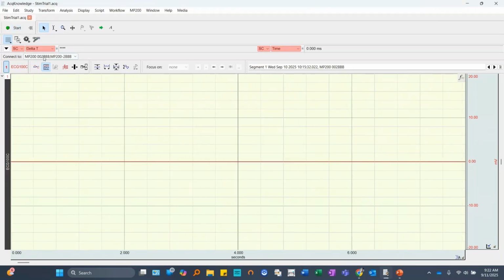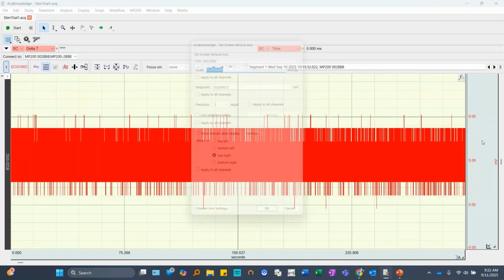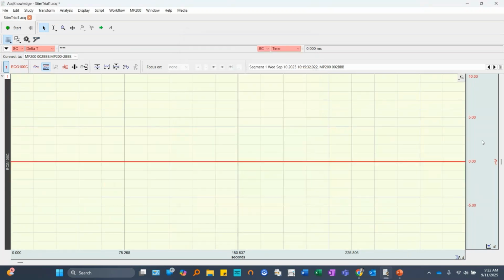And we will go back here to where we already have several minutes of data recorded. And so again, what you saw there was zoomed into the nth degree, so it makes it look like a ton of noise. But once we zoom back out, you can see we've got a beautiful flat line. And now what we need to do is build the pulses for the pre-pulse and the actual startle auditory that's going to be played through the stimulator.